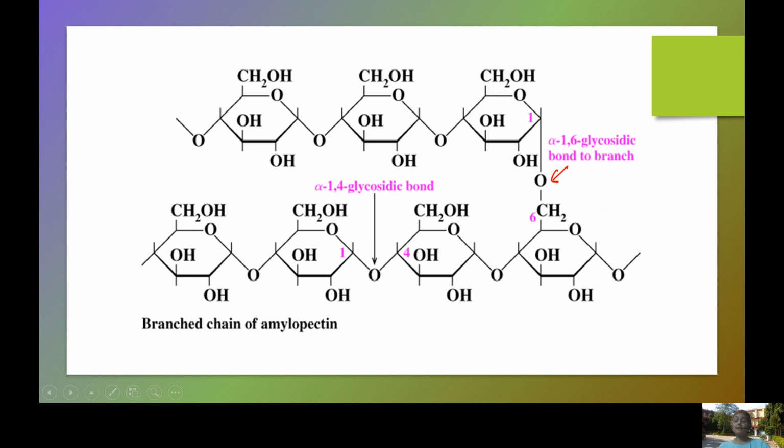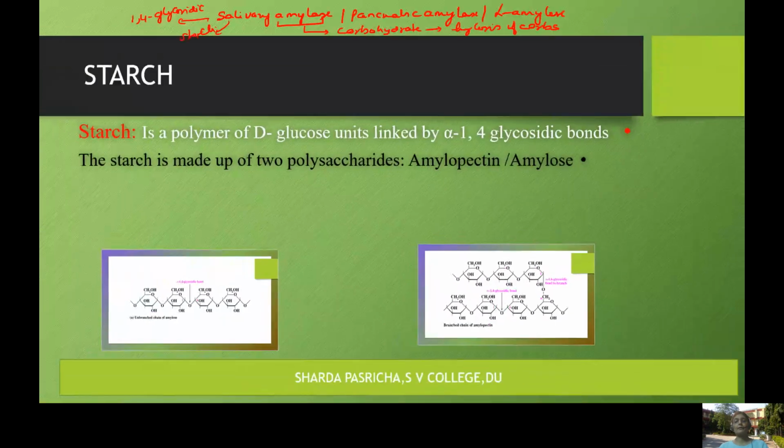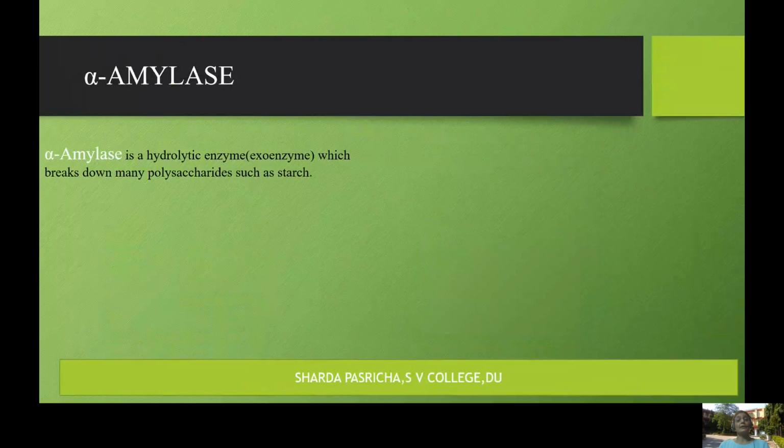So our amylase or the alpha amylase or the salivary amylase, as I said, will cleave these glycosidic linkages and not these. Okay.